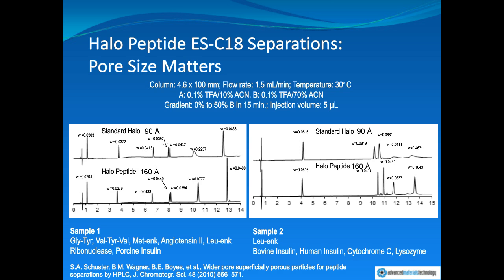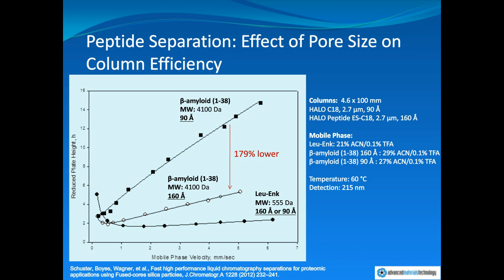Again, using typical acidic mobile phase conditions. Also, somewhat elevated temperature conditions. And we'll talk a little bit more about why temperature is quite important. So in this plot, again, a similar linear velocity versus efficiency plot.